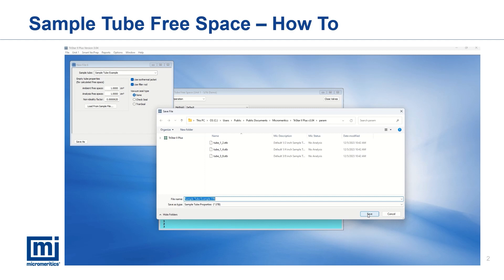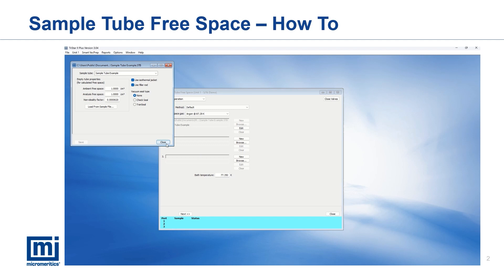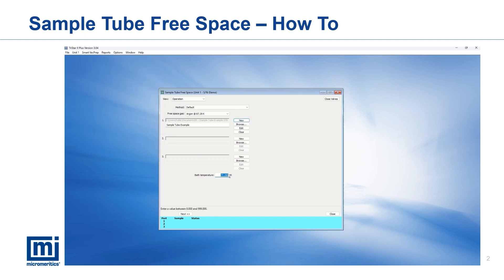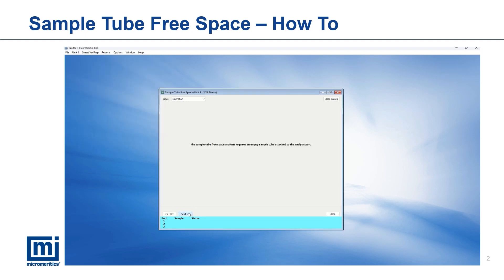Ensure accurate recording of the bath temperature as this will impact the determined free space values. Additionally, the temperature used in the free space measurement should be the same as the temperature of the analysis bath. Click Save As to save the sample tube file, then click Next to begin sample tube free space measurement.